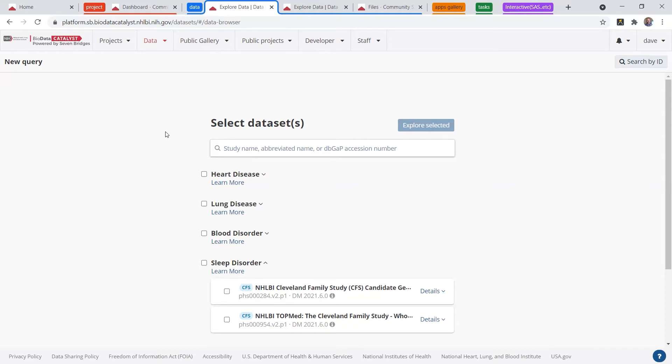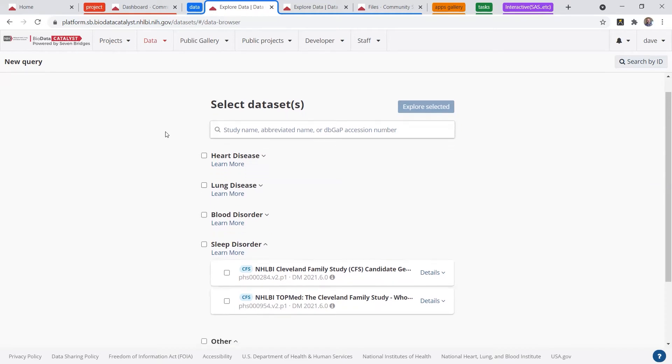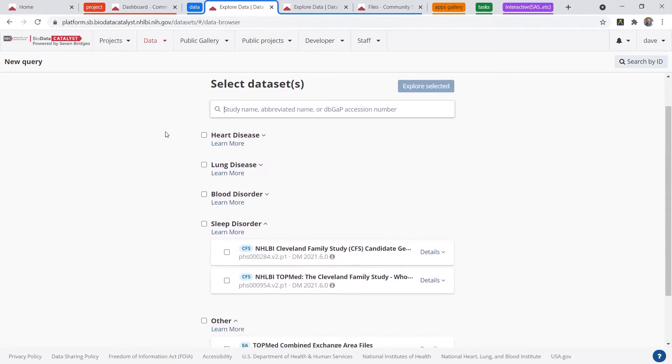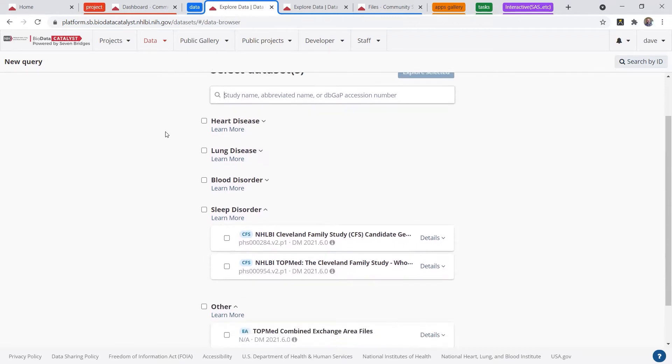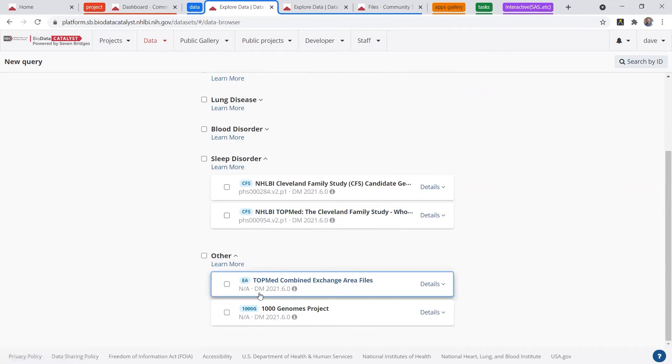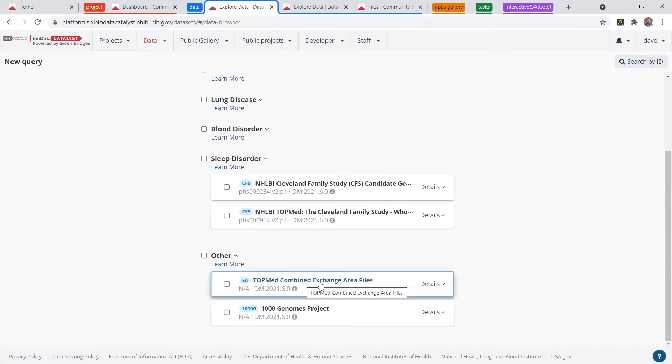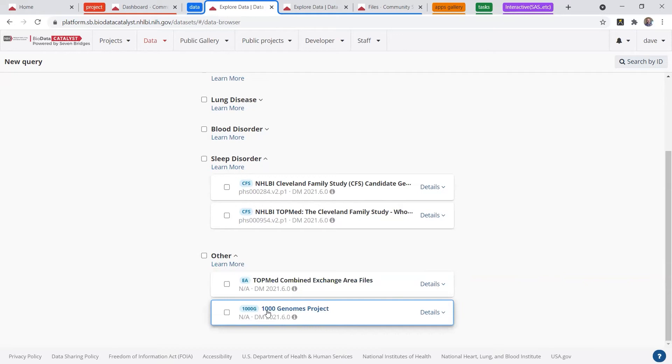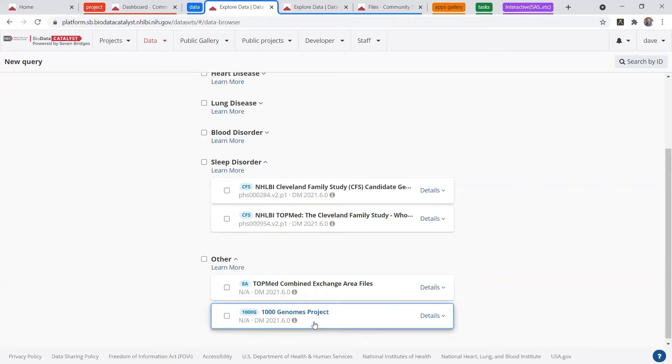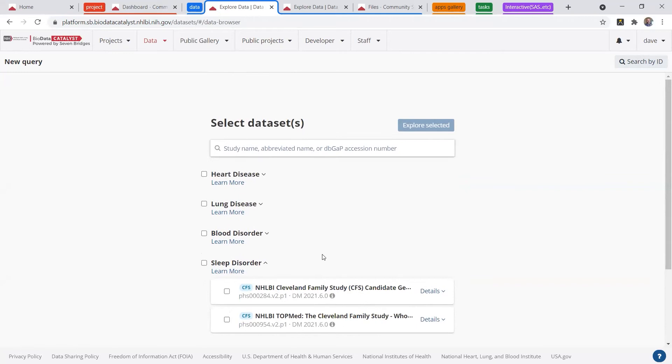So in this data browser, we have the TOPMed studies organized by disease type, so heart, lung, blood, sleep. And then there's also a section for the combined exchange area files and the 1000 Genomes Project open data, which is great for testing. All of these are hosted by NHLBI.